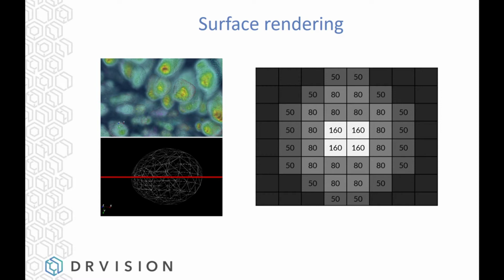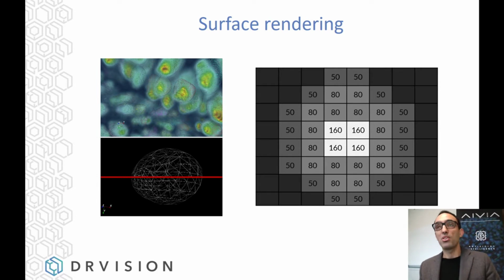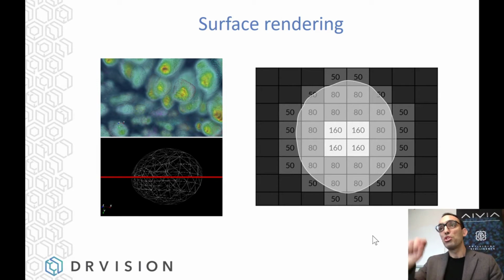So that is what an optical section would look like for that kind of image. Okay, so that's what it would look like if it's an optical section through a cell like this. When we then want to segment this region, we set thresholds typically. That's how things are typically done. You set a threshold. In this case, I set a threshold of 70, so somewhere between 50 and 80, there'll be an ISO line or a boundary created. And that's for one optical section.